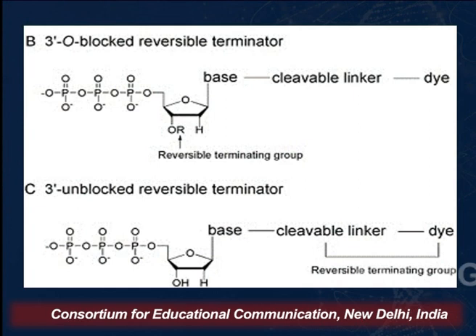So what happens is, when you add a particular nucleotide, the chains will be terminated at that point and the signal will be detected. But then this R will be replaced by H and the fluorophore will be removed. Therefore, one nucleotide has been incorporated, which is now extensible. So you add the second nucleotide containing a different fluorophore, for example.